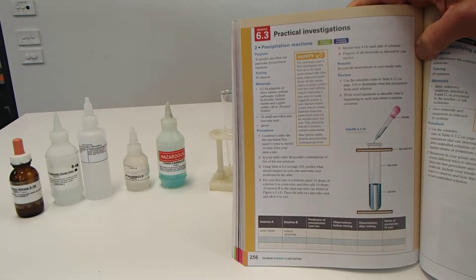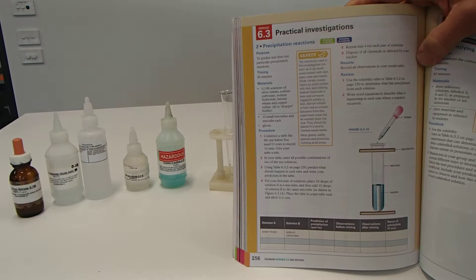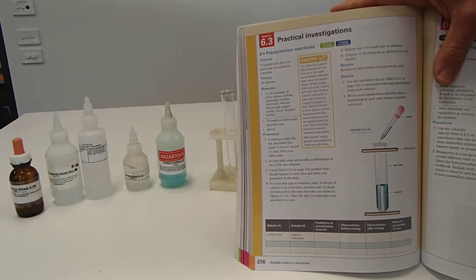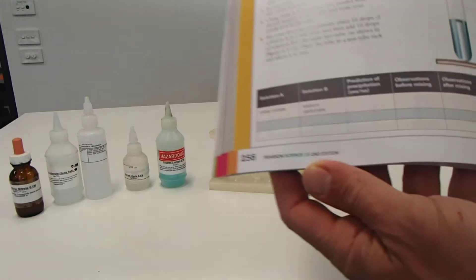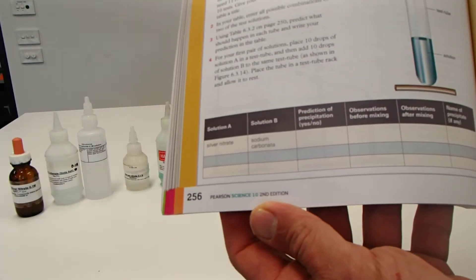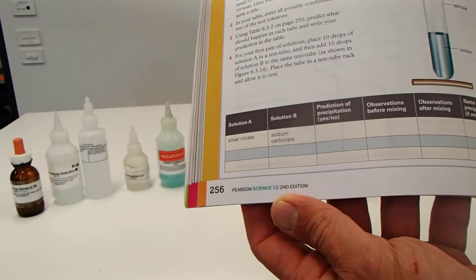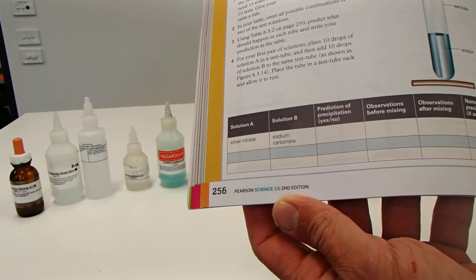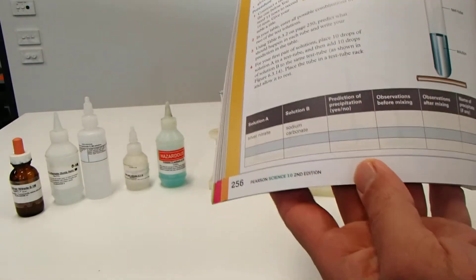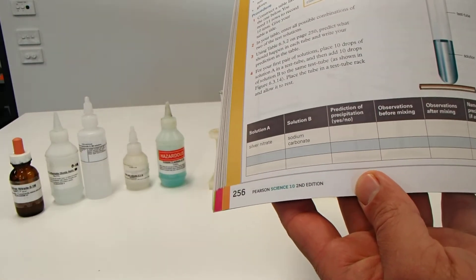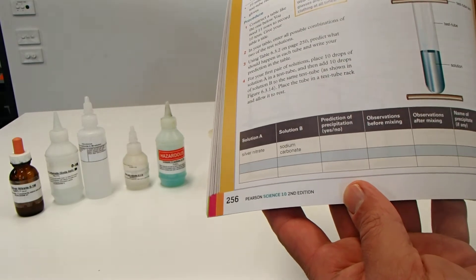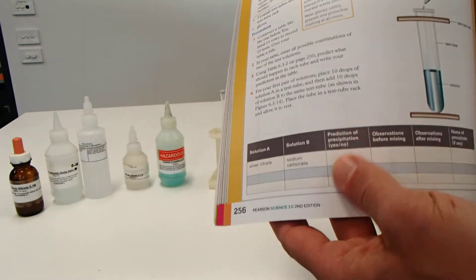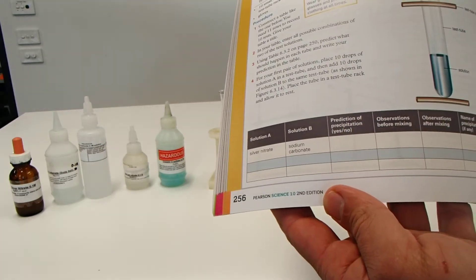Hopefully by now your teacher's been through it or you've read the compass or Google lesson plan and you should have created a table or have access to a table that looks something like that. You should have also made a prediction whether you think there will be a precipitation or not based on the solubility table earlier on in the book. So you make a prediction and we'll see today if these predictions come out.